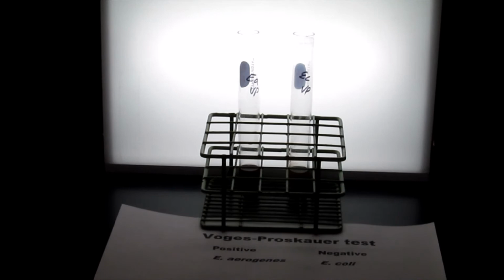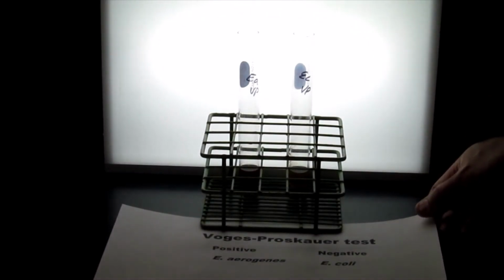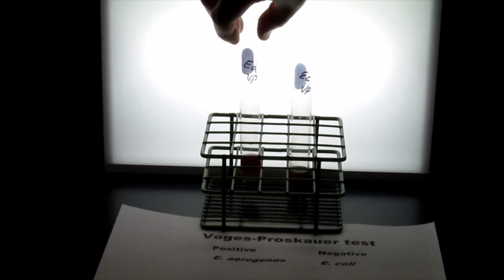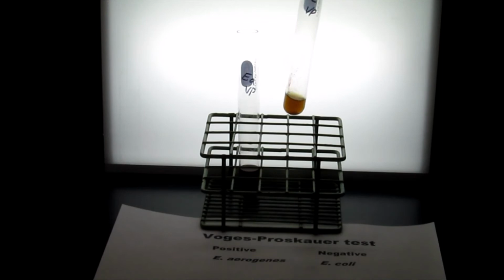Okay, in doing the converse test for testing for the presence of acetoin using the Voges-Proskauer reagents with the MRVP broth, we grow E. coli in the MRVP broth, and then look for the presence with the VP indicators.